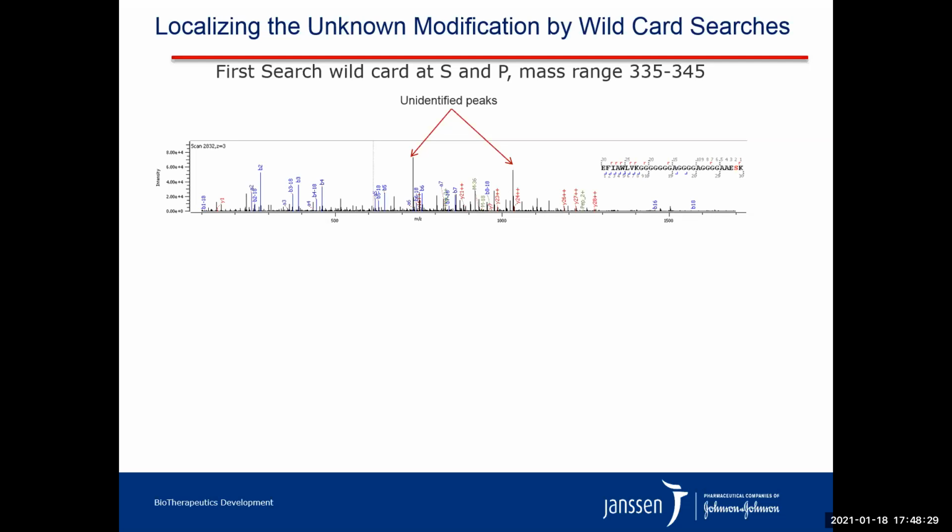We also noticed the absence of the cleavage at lysine 28, the same residue that's also oxidized. With these observations, we suspect that the 340 Dalton modification could possibly be associated with lysine 28.